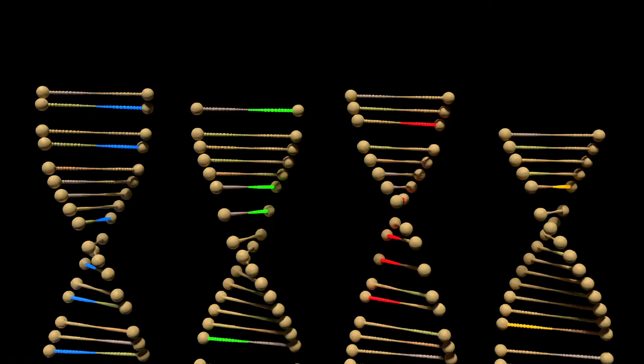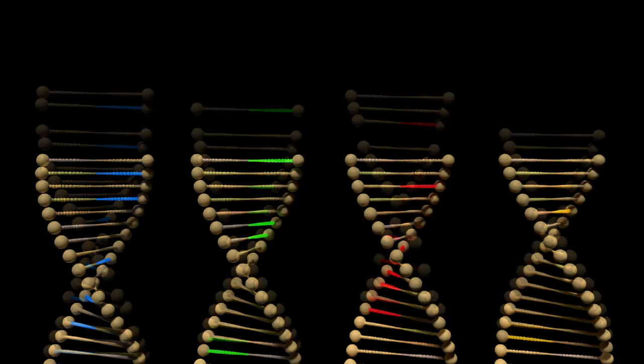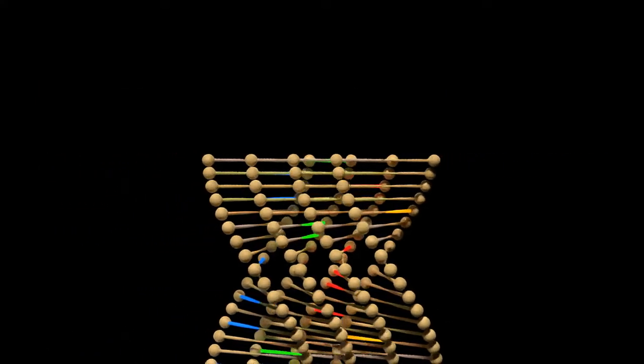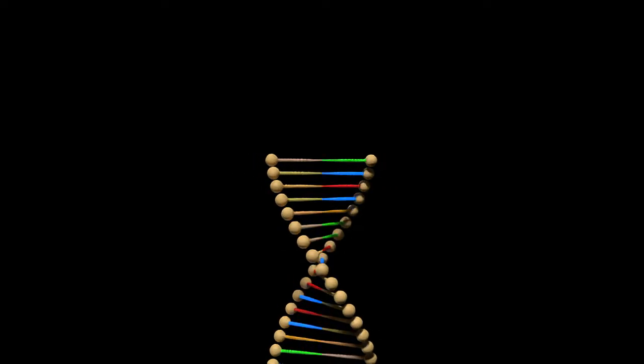This process is repeated in a number of cycles for all the four nucleotides. By the end of all the cycles, the tube will contain fragments ending at each of the nucleotide positions in the original DNA. The DNA bands may then be visualized by autoradiography or UV light, and the DNA sequence can be directly read. And that is how DNA sequencing is done.